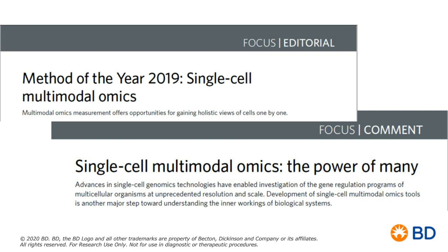It has the same feel and experience as what you're doing with your traditional flow cytometry data. However, it's actual sequencing data. And the data is basically the counts, which, when we think about counts, we would traditionally refer to as the MFI, which is a surrogate for the relative amount of antibody that had bound, which roughly corresponds to the amount of protein on the surface of the cell. It's not a precise measurement of the amount of protein, but it's a surrogate for us to look at the data.